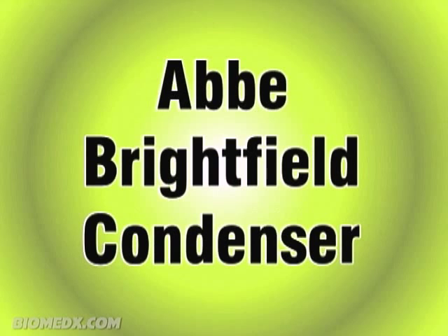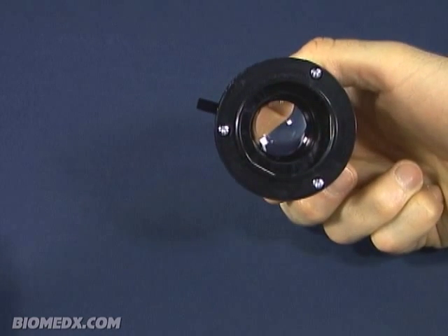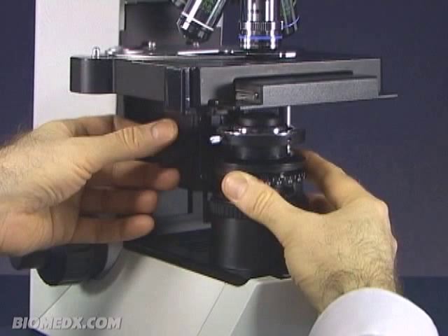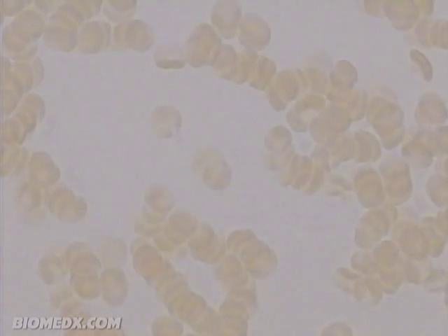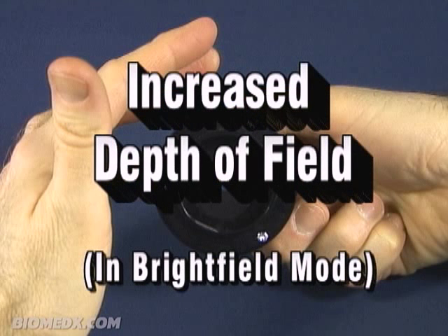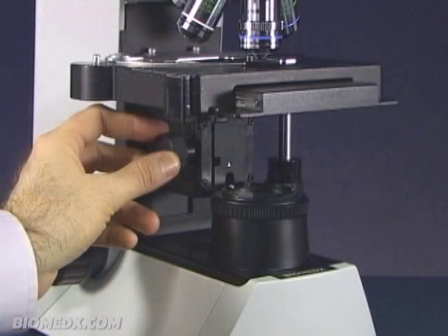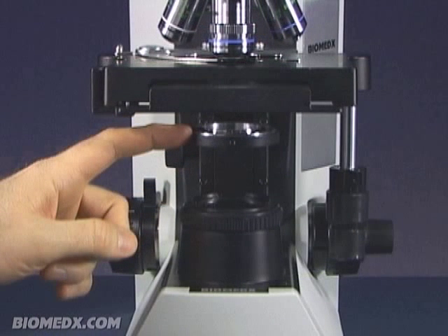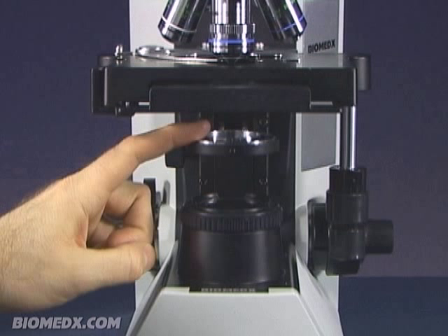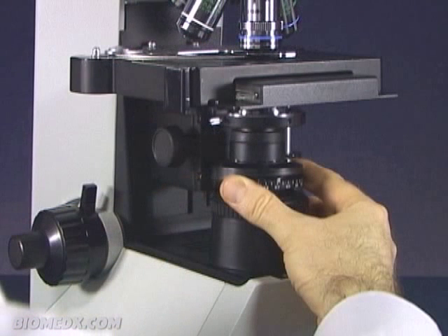This is called an Abbe brightfield condenser, named after Ernst Abbe, who long ago developed the lens structure. When an Abbe brightfield condenser is in place under the slide, you would be looking at your specimen against a bright field of light coming right through the lens assembly — hence the name brightfield. This particular condenser has an iris assembly, and when it is closed down, the depth of field will increase when viewing your specimen. All condensers will need to fit under the microscope stage, and on a BioMedx system, the condenser comes up from underneath the holder to fit in place.